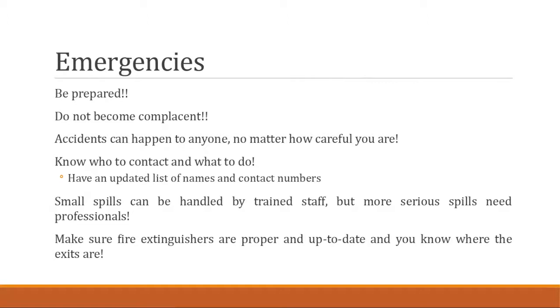Emergencies, you need to be prepared. Don't be complacent. Accidents can happen no matter how careful you are. I've had my share of accidents, and that's what I'm going to share with everybody in the laboratory when we get into there to talk. But I've had my share of accidents, and you learn.